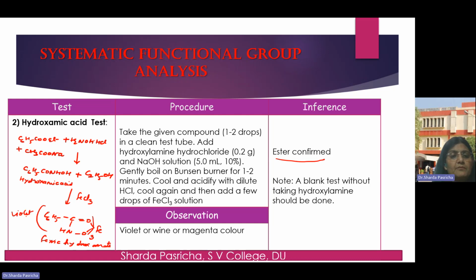That will be your violet or wine-colored precipitate being formed. Okay, so that is the test.